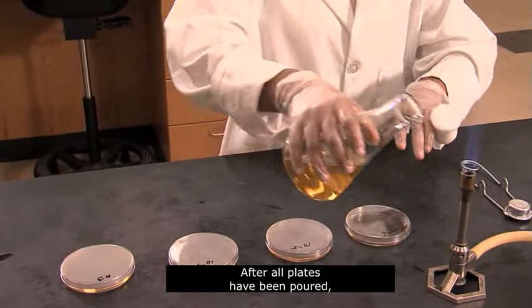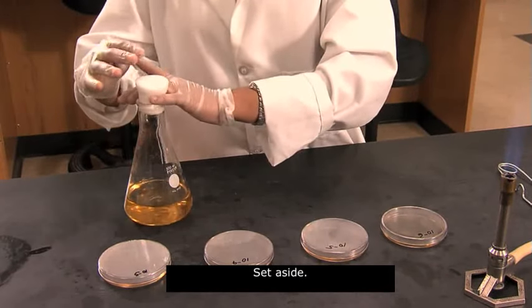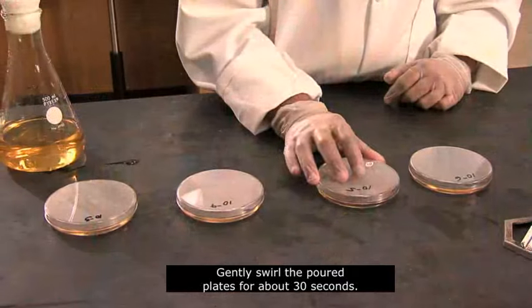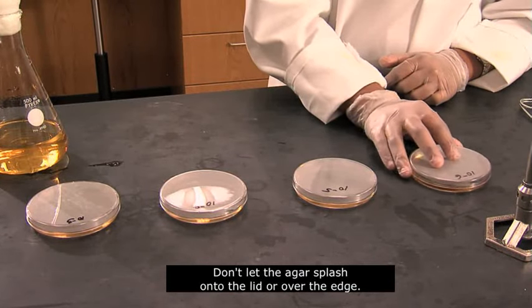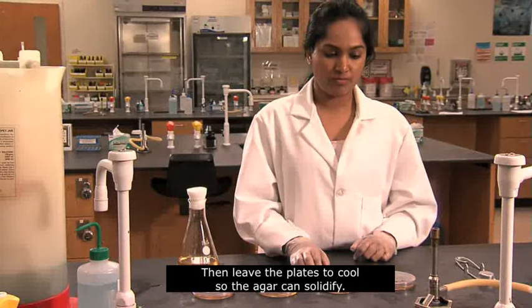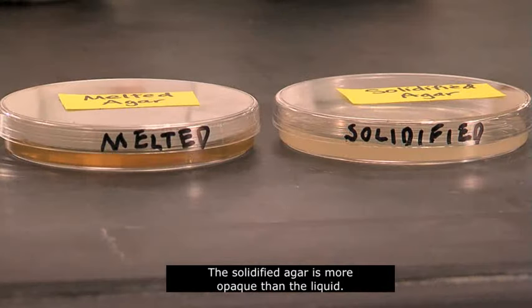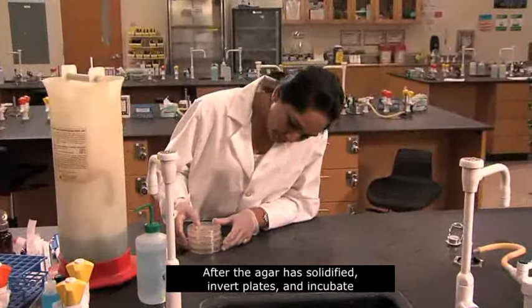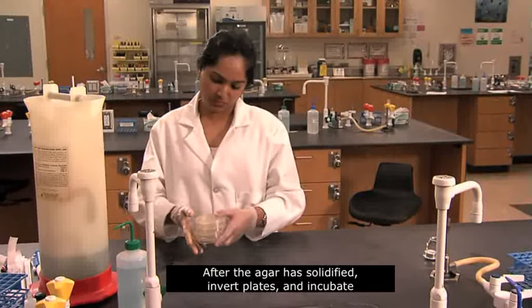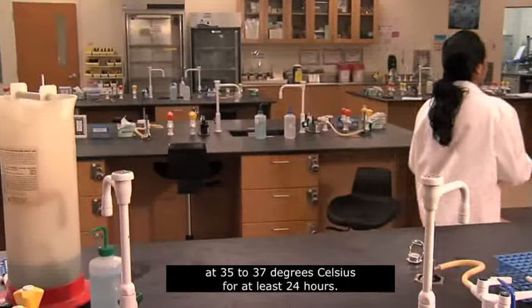After all plates have been poured, flame and re-plug the flask and set aside. Gently swirl the poured plates for about 30 seconds. Don't let the agar splash onto the lid or over the edge. Then leave the plates to cool so the agar can solidify. The solidified agar is more opaque than the liquid. After the agar has solidified, invert plates and incubate at 35 to 37 degrees Celsius for at least 24 hours.